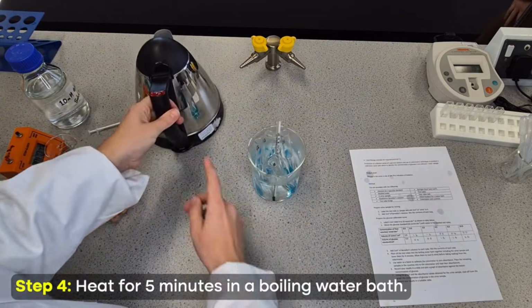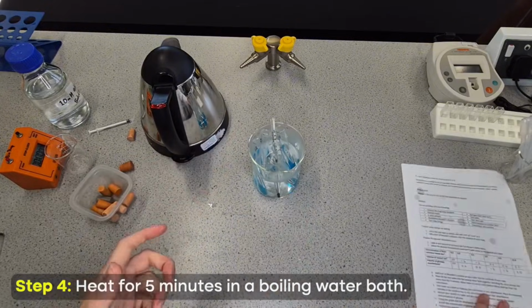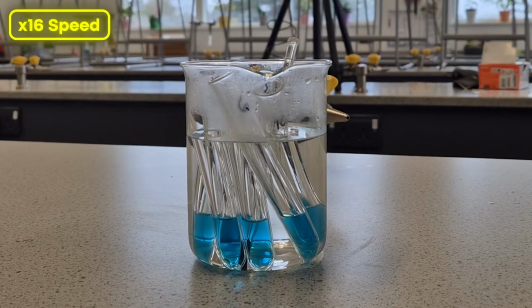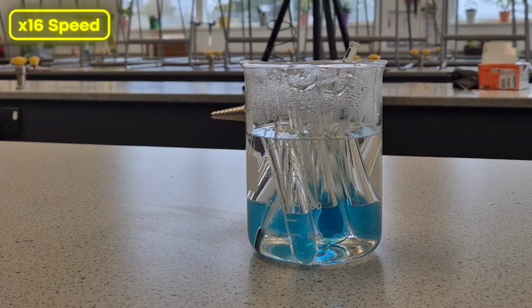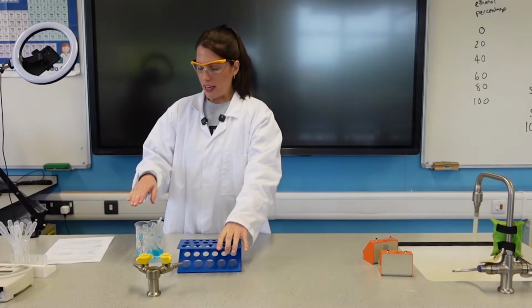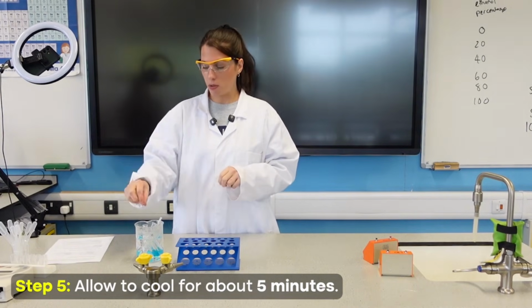I'm actually gonna boil the kettle again because it does need to be around 90 for this to work, and I can see it's already dropped. So that's now had long enough, but we need to let it cool for 5 minutes before we put our samples in the colorimeter.